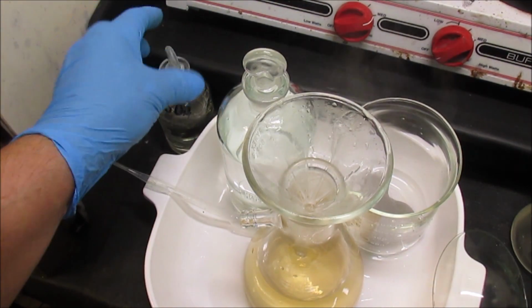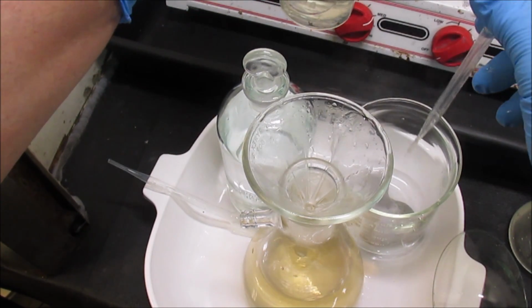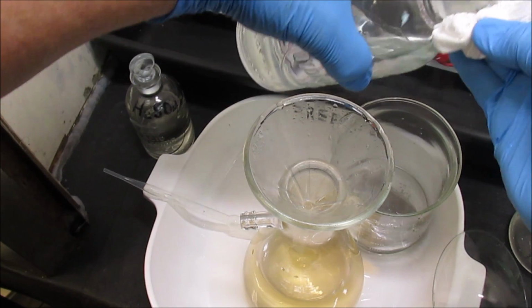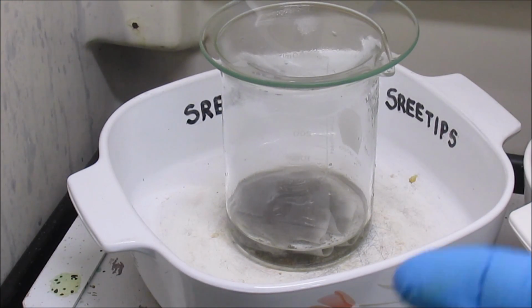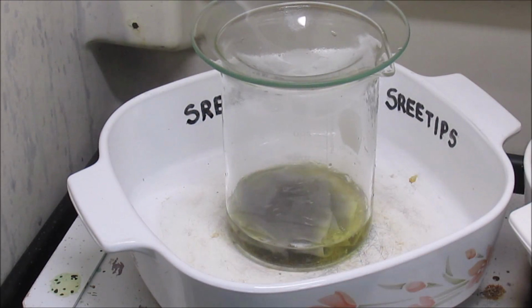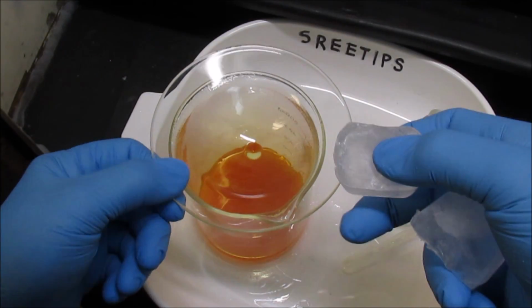Some sulfuric acid. Add some hydrochloric acid, about 50 ml. Cover it up, get it on the heat. And this time I'm adding 4 ml maximum of concentrated nitric acid. Minutes now. Everything's in solution. Pull it down off the heat. Let it cool again. We're going to add a couple ice cubes here and get it cooled off.